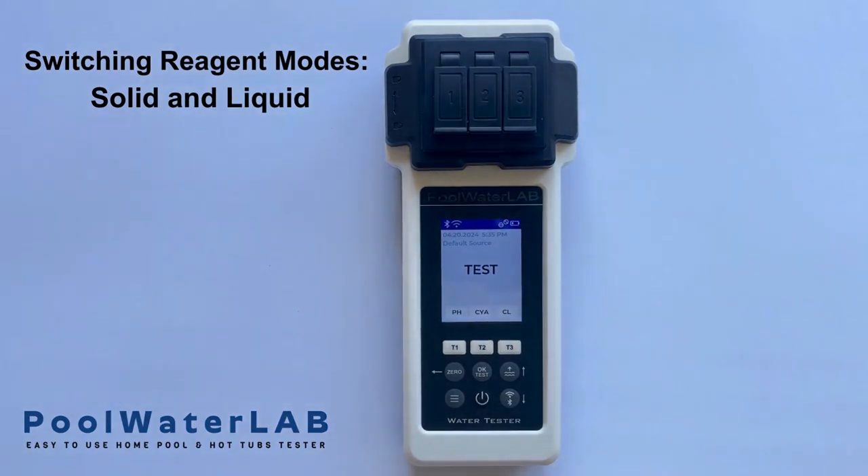To switch from solid to liquid reagent mode, or vice versa, enter the menu by pressing the menu button. Using the up and down buttons, select the droplet icon to access the menu of modes. Once you've made your selection, press OK.